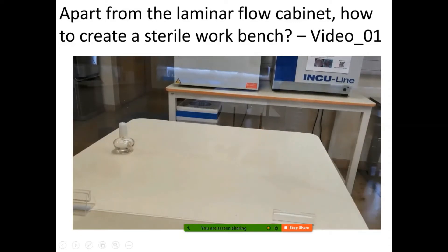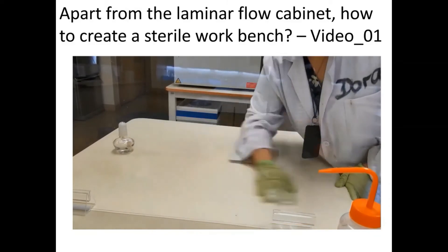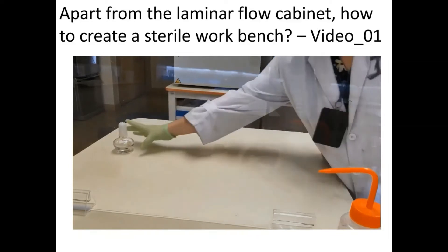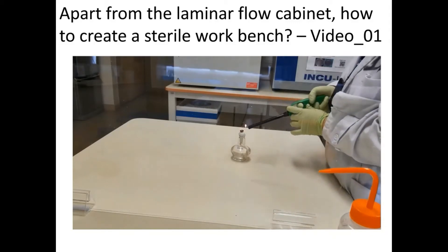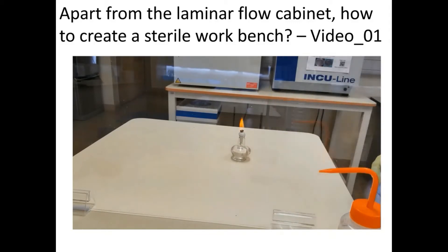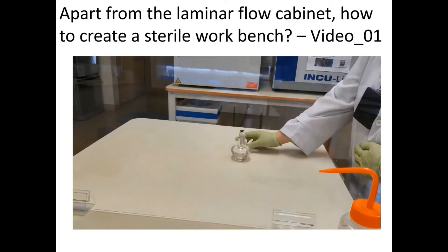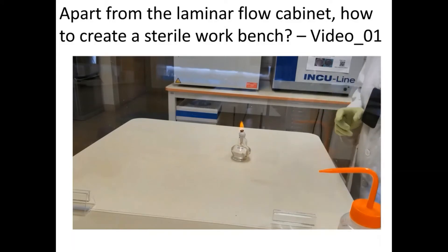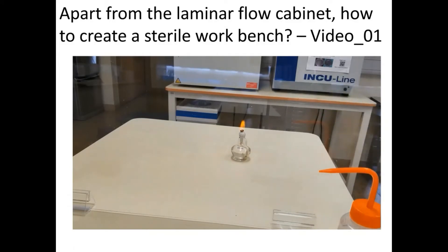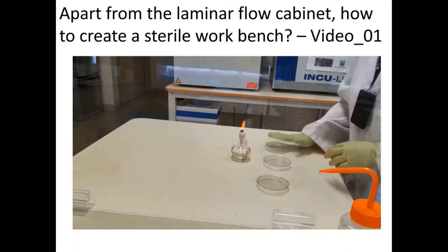First of all, use an ethanol wipe to sterilize your working bench, then use a paper towel to wipe it down. Next, use the alcohol lamp — ethanol lamp — and with a lighter you can light it up. This will create an airflow that produces a sterilized environment near the flame. To switch off the ethanol lamp, just give a swift close with the cap to cut off the oxygen. Then you turn on the ethanol lamp again and work your plate near it.